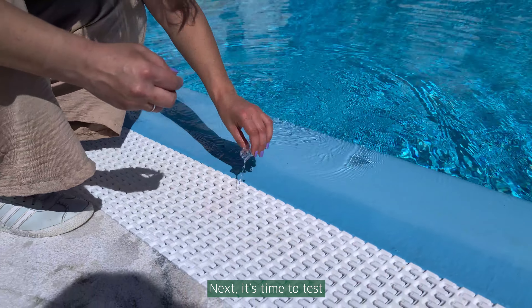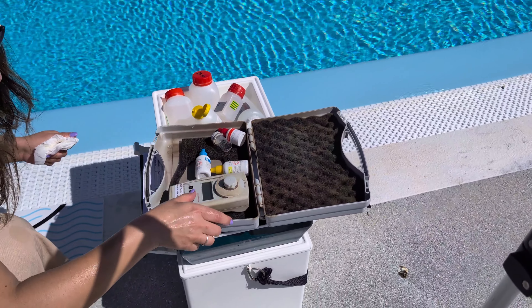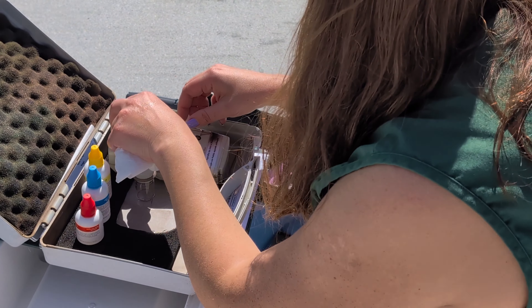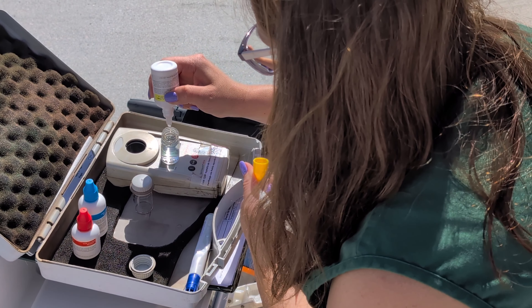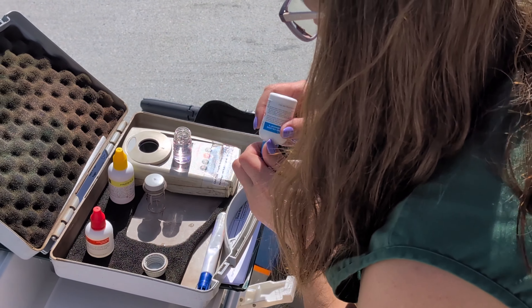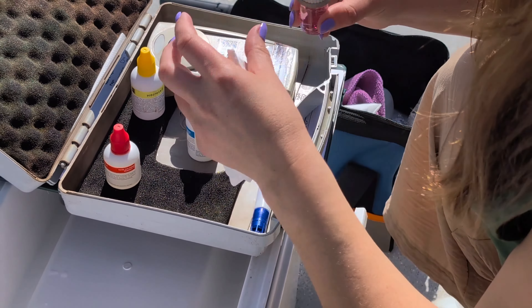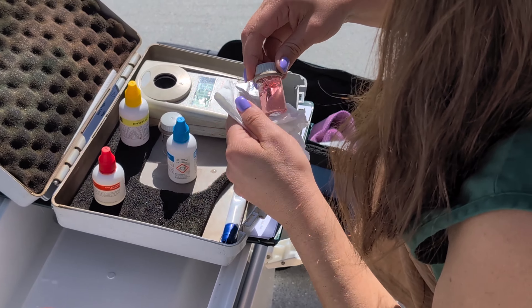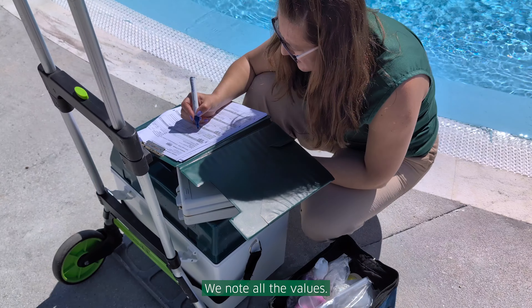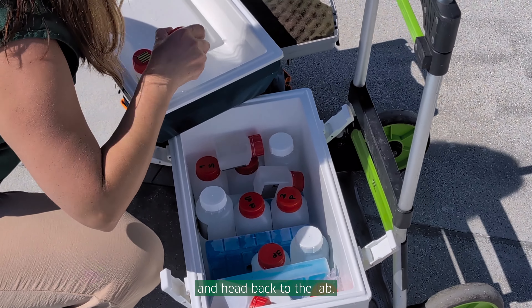Next, it's time to test the chlorine levels in the water. We note all the values. Then, it's time to pack and head back to the lab.